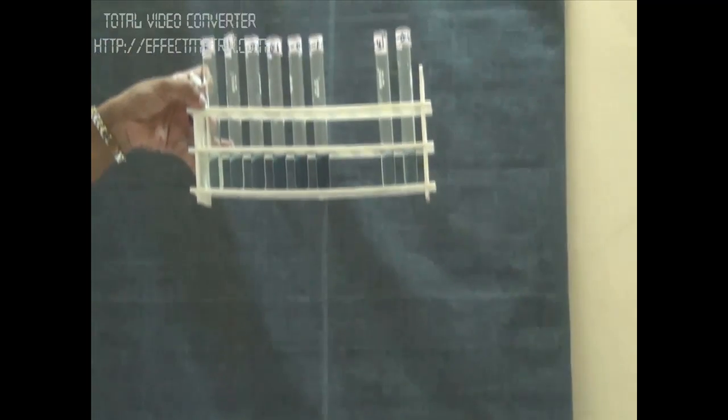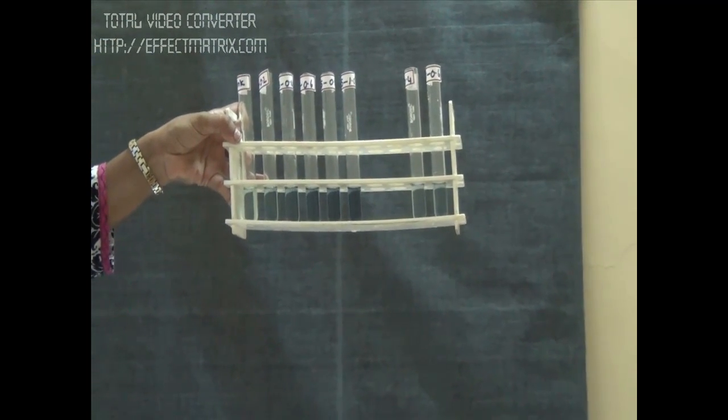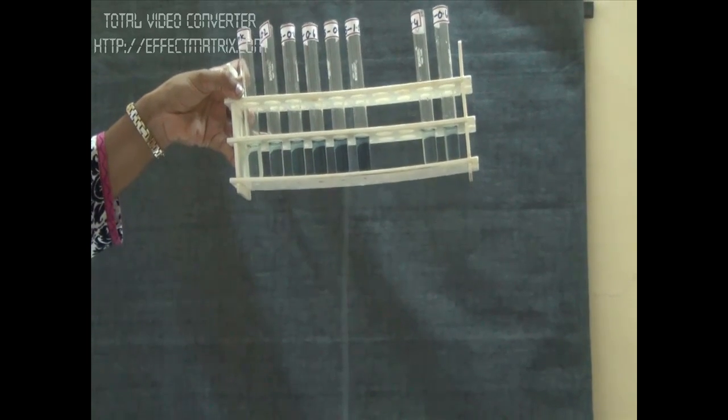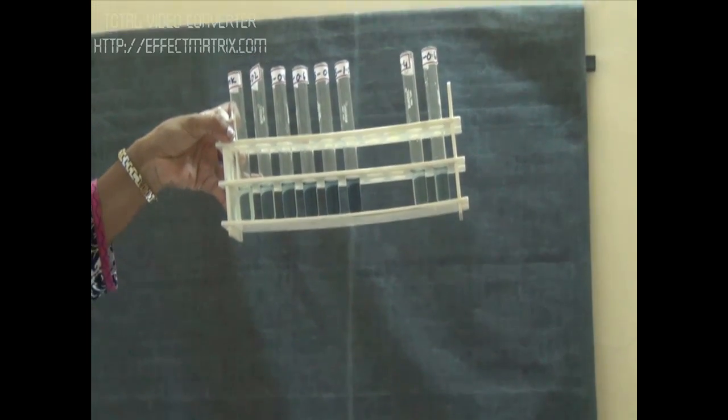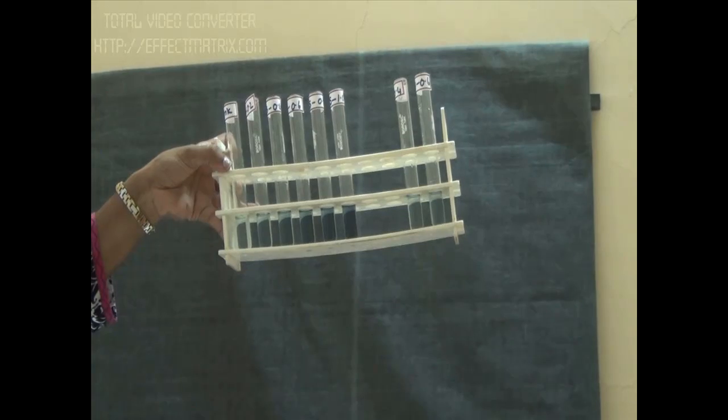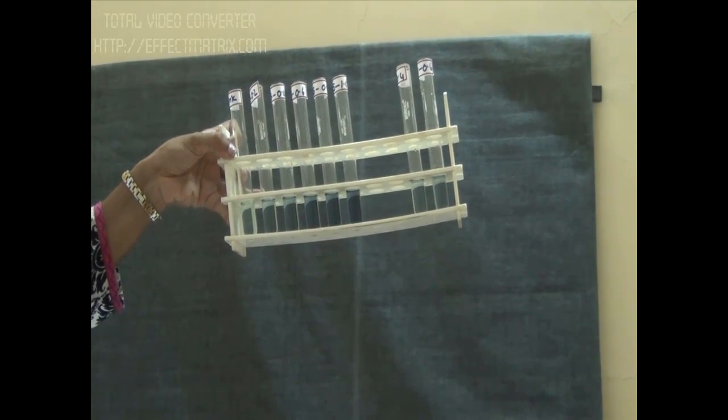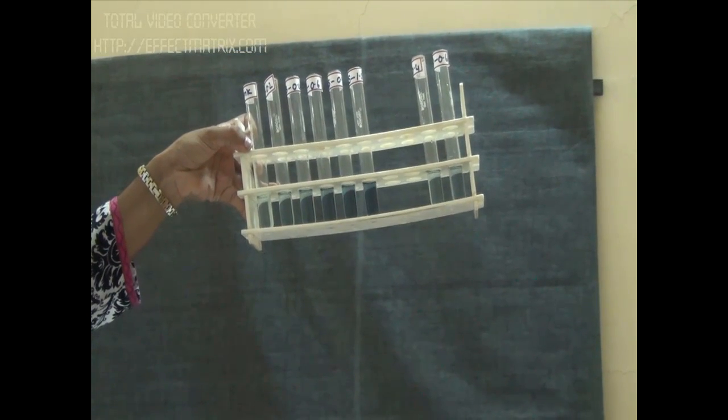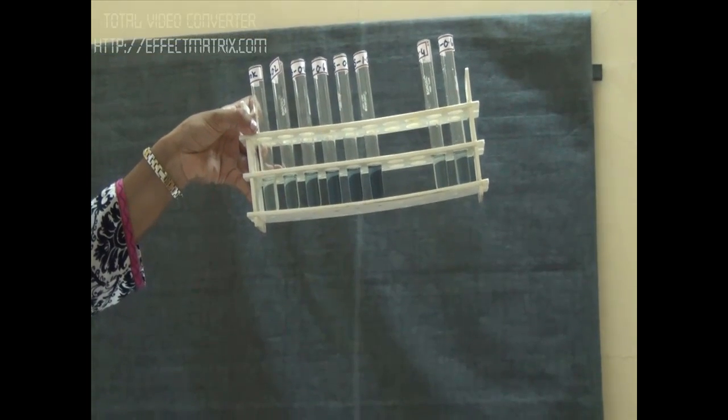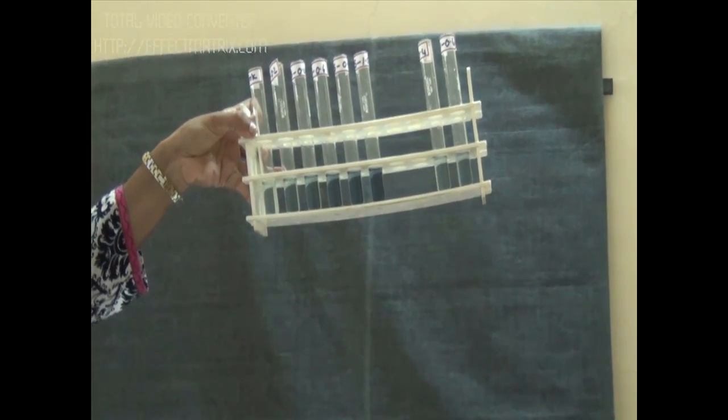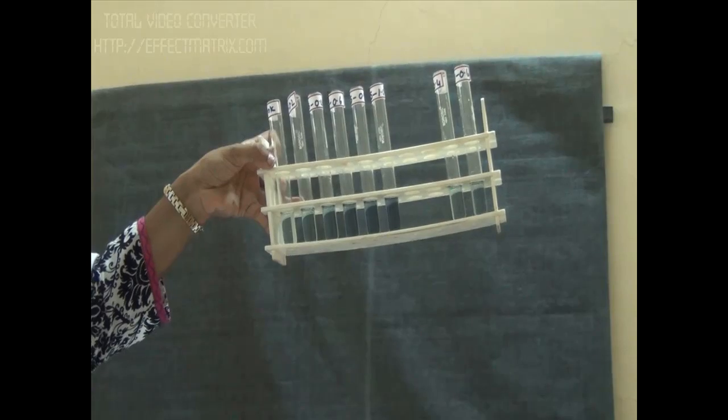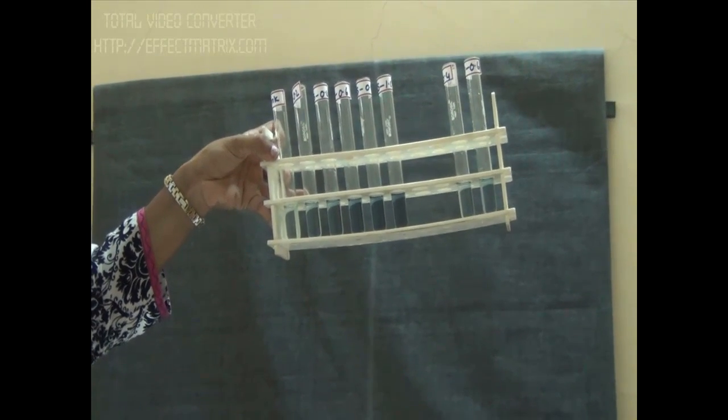Now we have removed the tubes from the water bath which was kept at 37 degrees. We can clearly see the increase in the intensity of the color, which indicates the reaction of the protein with alkaline CuSO4 and Folin's phenol reagent. We will now measure the concentration of protein in each tube by measuring absorbance at 660 nanometers.